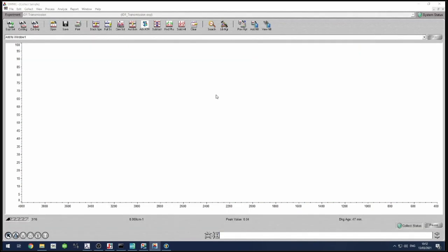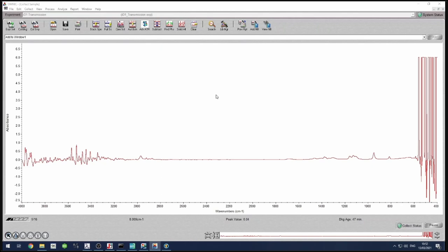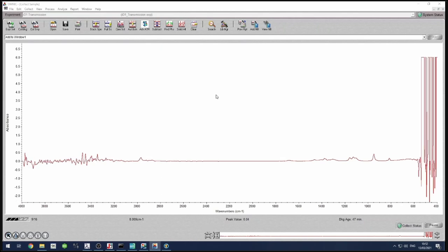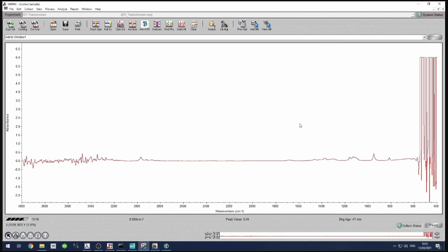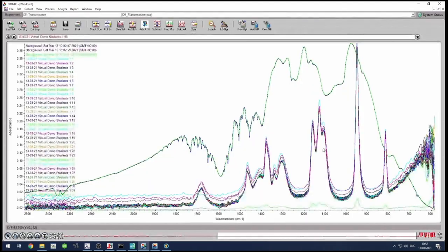It's now refreshing, it's capturing more spectra. So it's going to overlay those again on one another. And we can, as I mentioned, zoom in. But when it comes to processing the data and interpreting it, we have to take a few extra steps. This is not as simple as just an image analysis method.